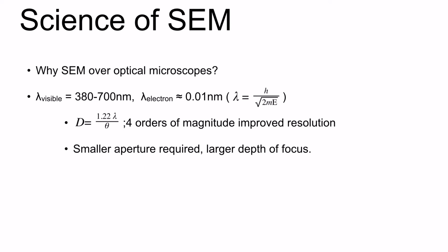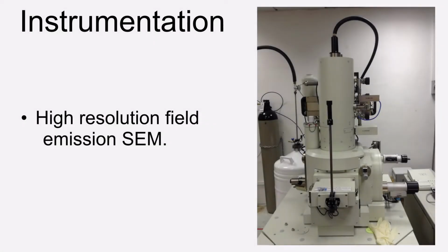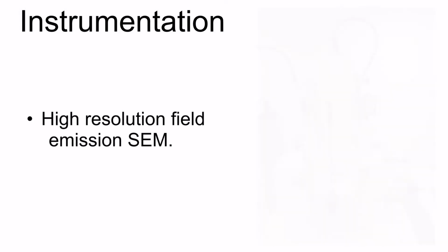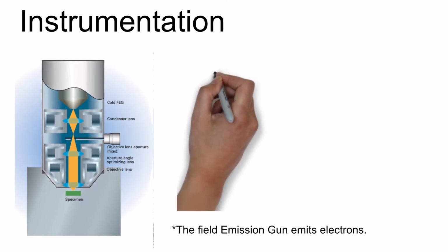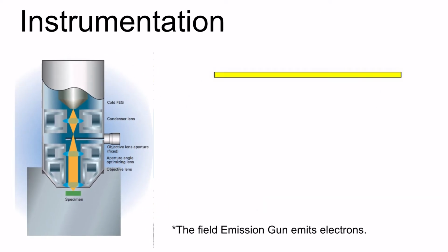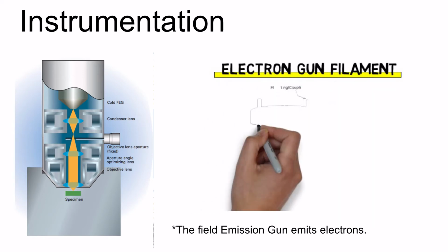The SEM used in the present experiment was a high-resolution field emission SEM, which is equipped with a field emission gun and enables us to resolve structures at a scale of 1 nanometer, while typical light microscopes only resolve to around 200 nanometers.